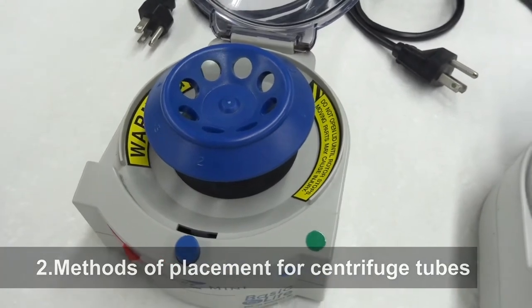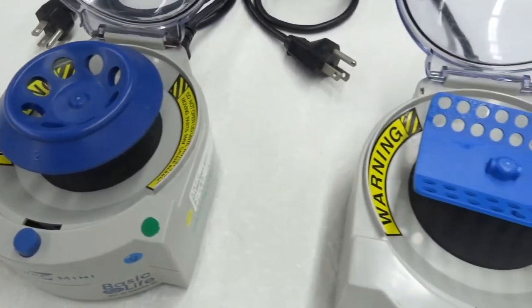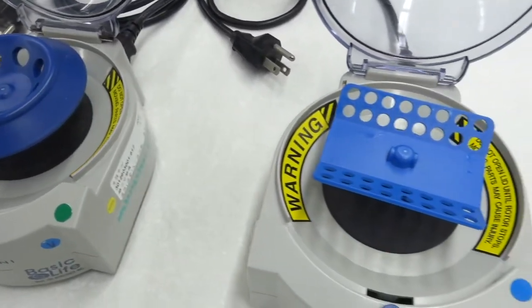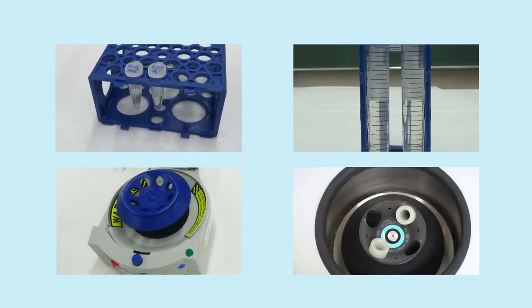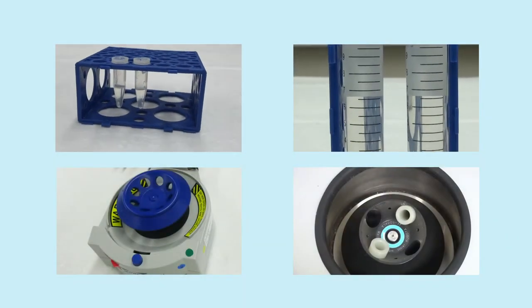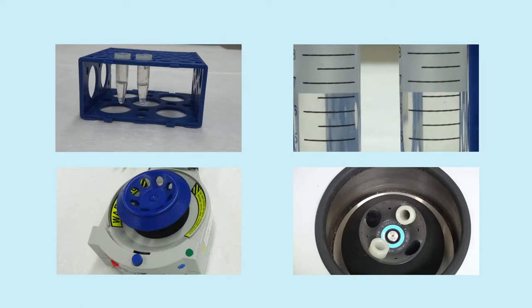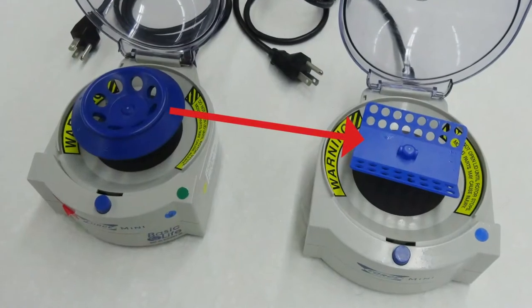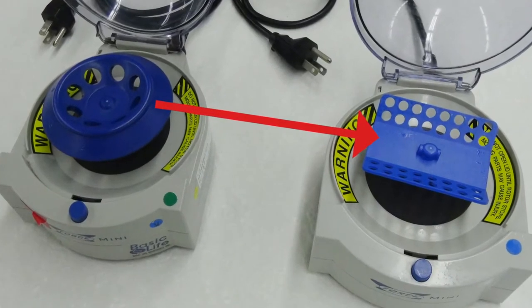Methods of placement for centrifuge tubes: Each centrifuge has its corresponding centrifugal rotors of different types. Choose the appropriate rotor in correspondence to the centrifuge tube size. Please follow the device manual's instructions when replacing the centrifugal rotor.